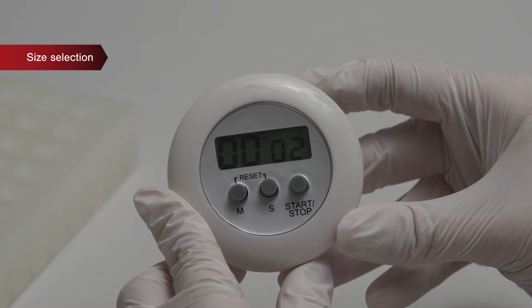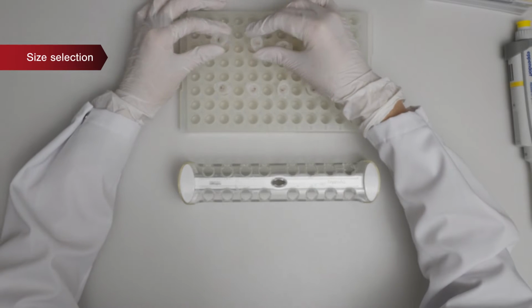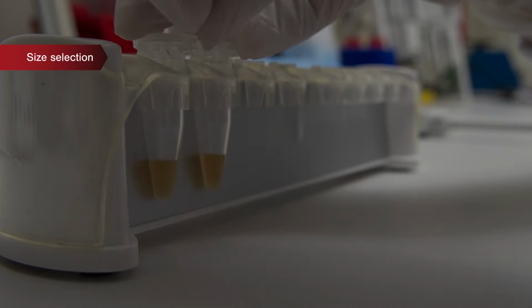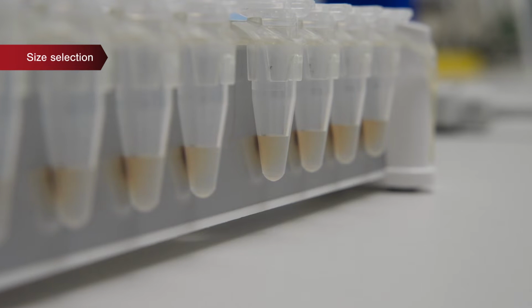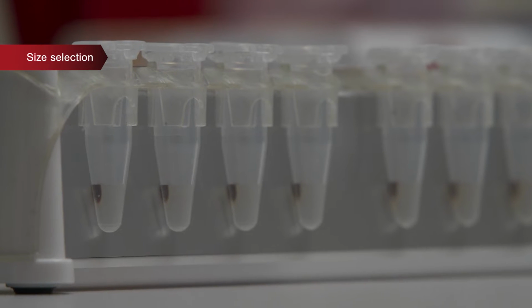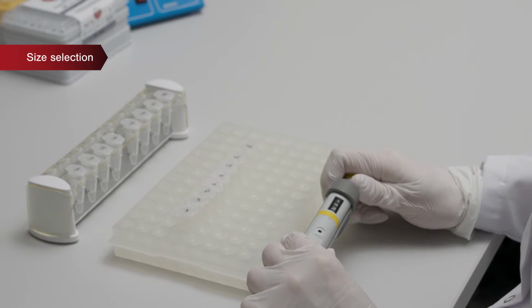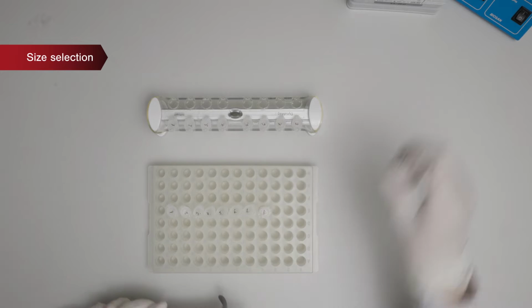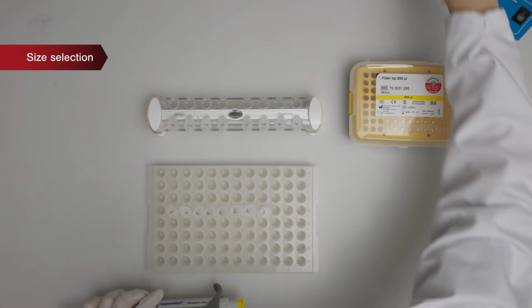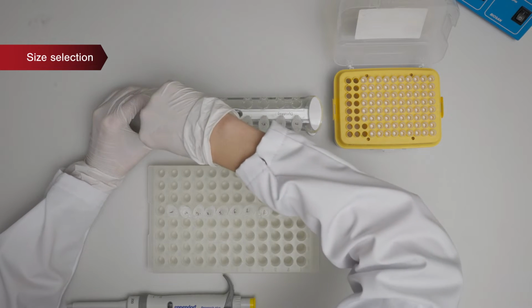After 5 minutes of incubation at room temperature, the tube is placed on a magnetic rack for 2 to 5 minutes. Then the supernatant is carefully transferred to a new tube without disturbing the beads. Tubes containing the leftover beads together with fragments that are too long are discarded.